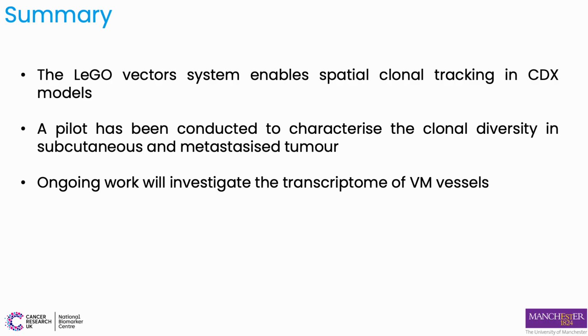So in summary, we have successfully implemented the LEGO vector system in CDXs to track the spatial clonal development, and our pilot study shows a very different clonal profile and clonal diversity between subcutaneous and metastatic tumors.